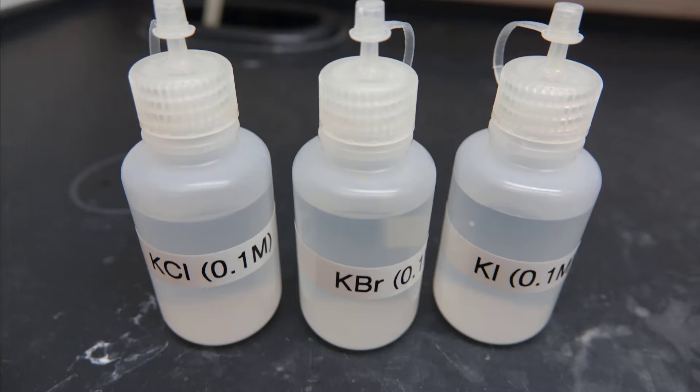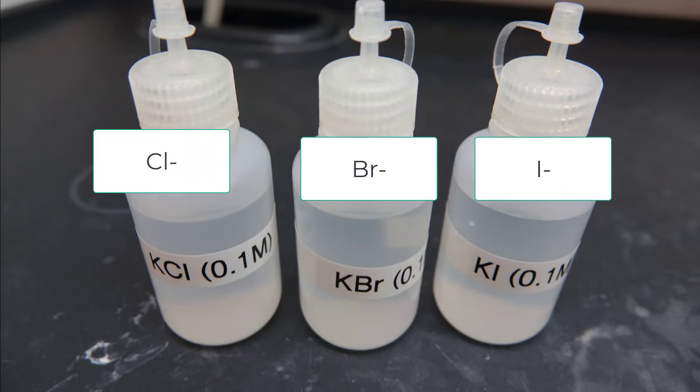You cannot add an ion by itself so it has to be part of a neutral molecule. What we really want from these is the Cl minus, the Br minus, and the I minus. The potassium is just along for the ride and we can ignore it for our experiment.